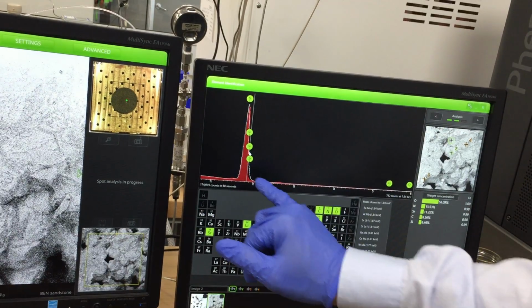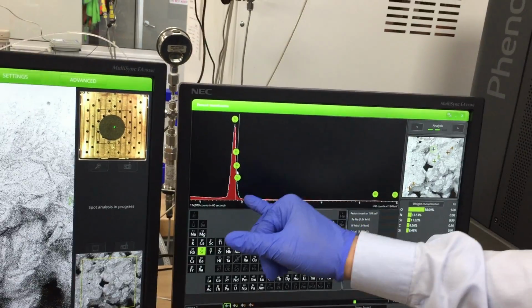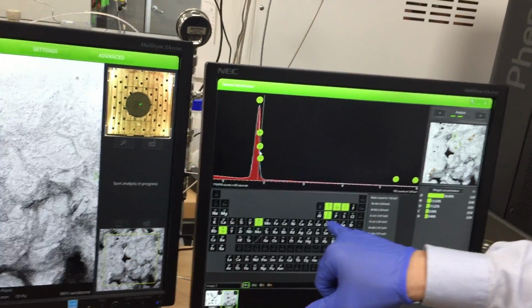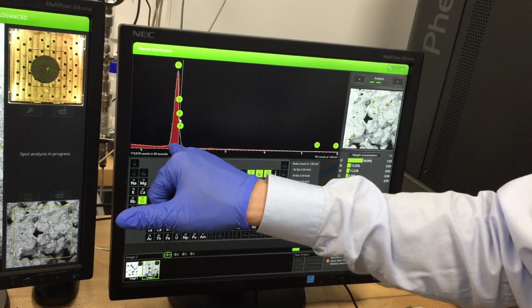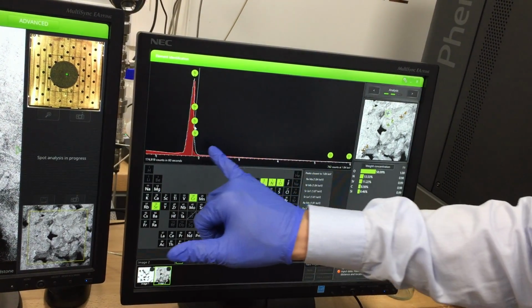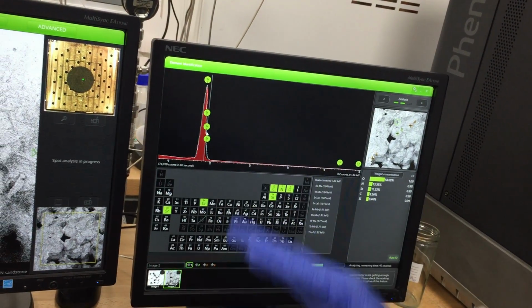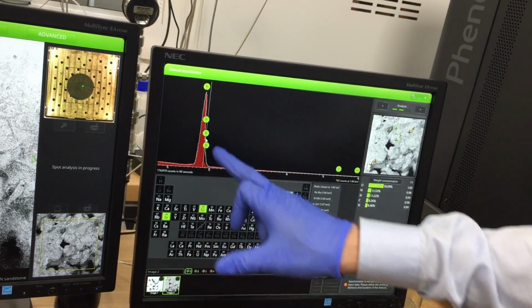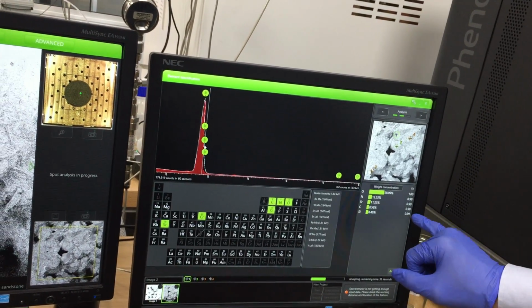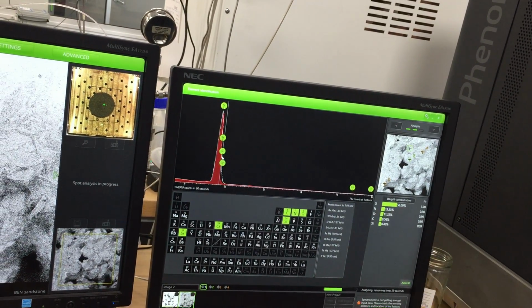Okay, just briefly, the red area means the actual collected signal. The white is the calculated signal. What calculated means is it's trying to assign and calculate based on the red area. To get really good assignment of the peaks, you have to overlay the red and white areas well. If there is a mismatch, that means something is off. In order to assess whether a particular peak assignment is good, look at the fit. If the fit is perfect, if the fit is 0.99, it's really good. If anything is less than 0.95, you have to take a close look at it.